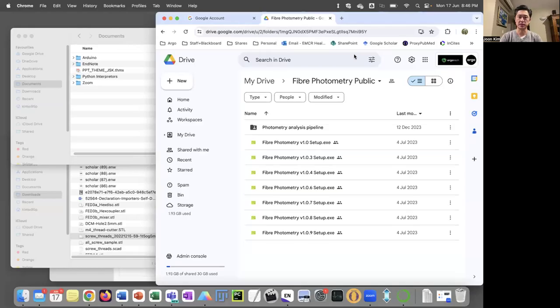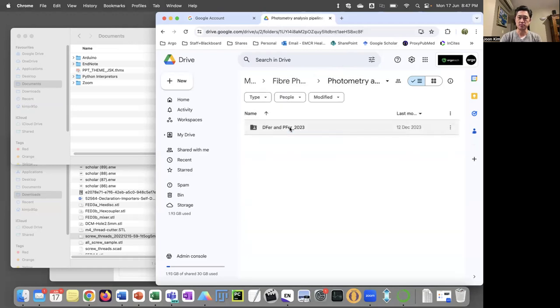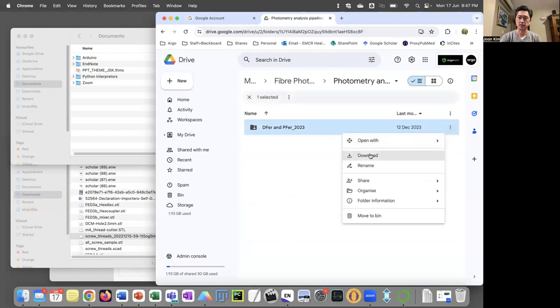So I'm recording this video for those who would like to use the fiber photometry analysis pipeline and need a bit of guidance with loading the Python codes. If you click the link from the Argotech website to download the analysis tools, you'll be prompted to this Google Drive. You need to click on the analysis pipeline and download this folder entirely.